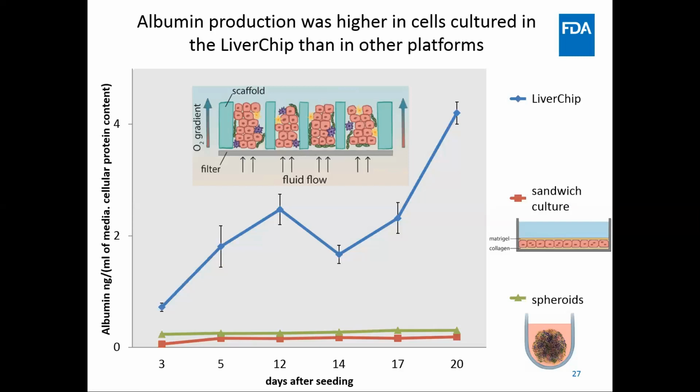This was done with a specific batch of primary hepatocytes, and now we're doing it with another batch to see if we can replicate these results, and we'll be publishing those results soon.